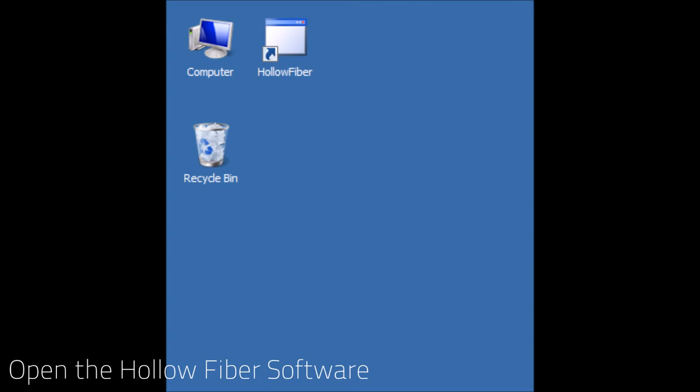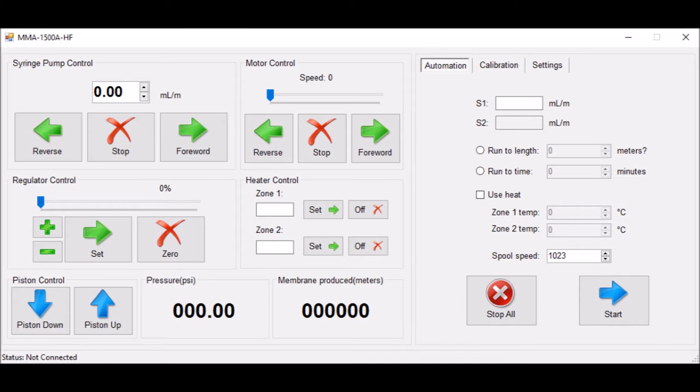To begin operation of the machine, first select the hollow fiber software icon. When the software opens, you will see a manual control panel on the left side of the window. From here, you can control the syringe pump, regulator, pneumatic piston, motor, and the heaters.